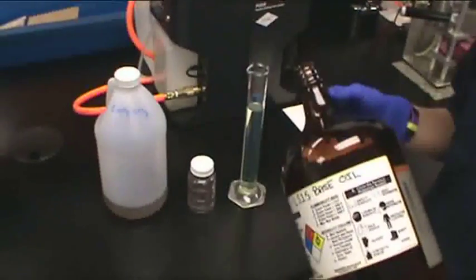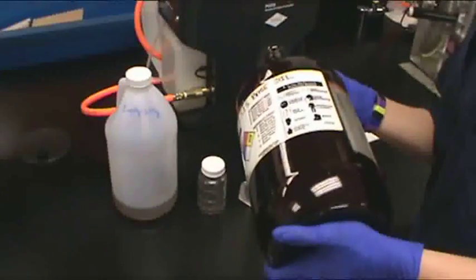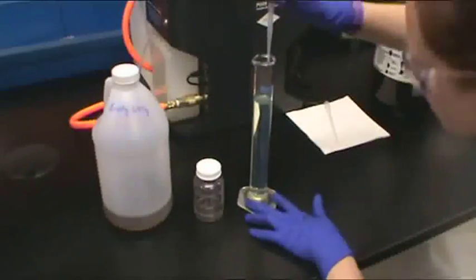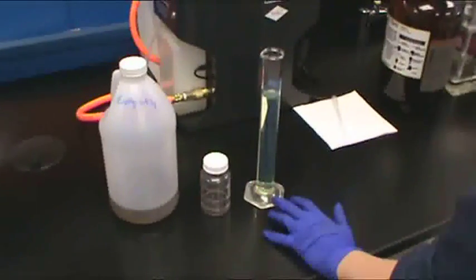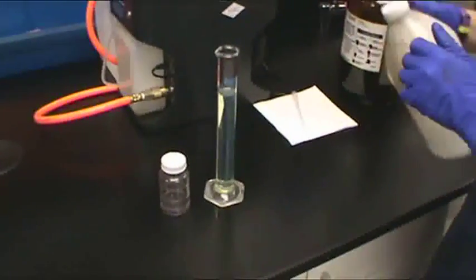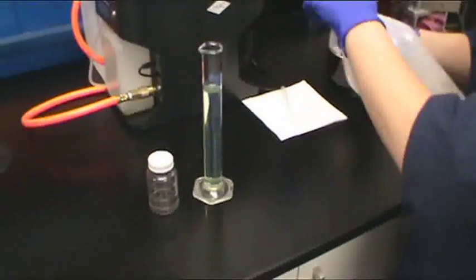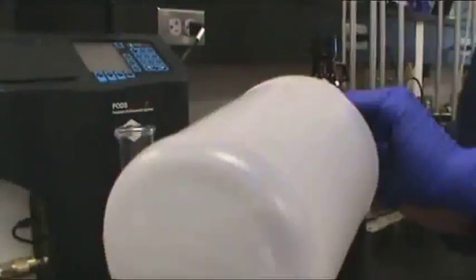The next test found in InSight Services' new filter debris analysis process brings us to the HIAC pod, which can perform an optical particle count on the debris collected from the filter. The purpose of the particle count is to provide secondary quantification trending in addition to patch creation, which will take place in the following test. The particle counter is able to detect a wide range of particles.